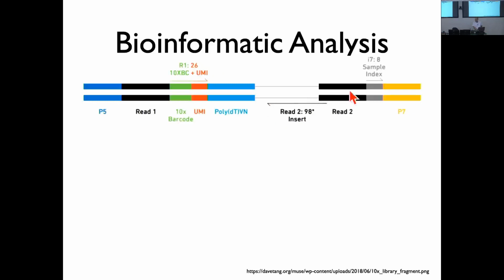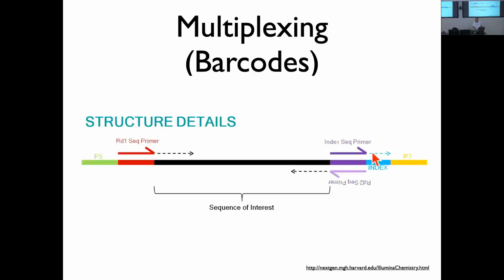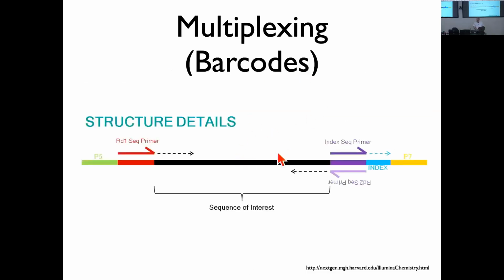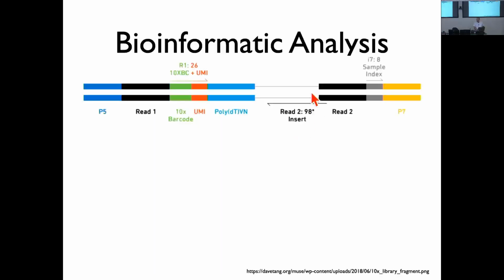And then you can also have, and often you'll have, per sample index barcodes, and those are just like these. Then the differences are, well, this part is actually the same. This is the biological sequence, which is the same as here. The size of the insert here is usually pretty small. And then the other stuff here is what's specific to 10x.